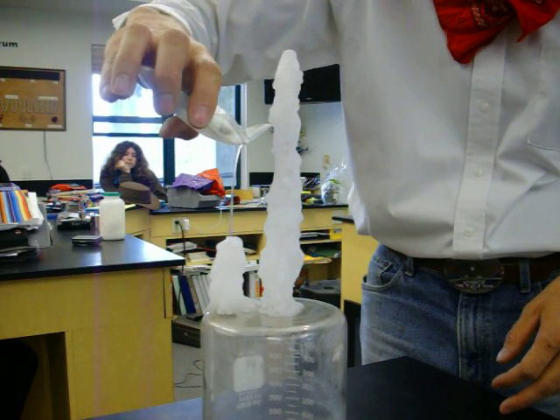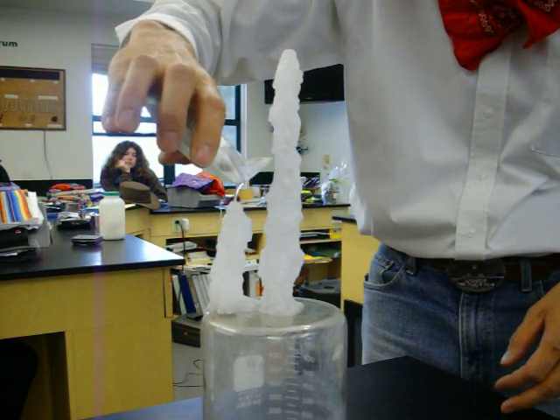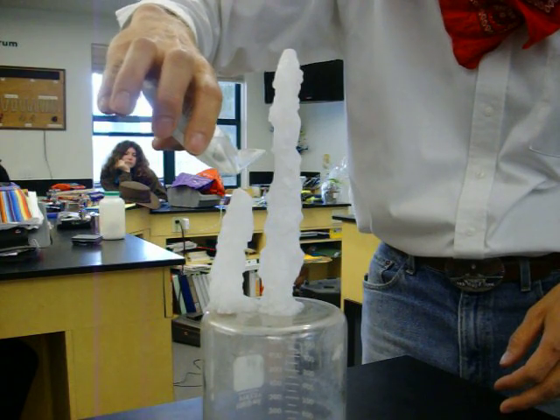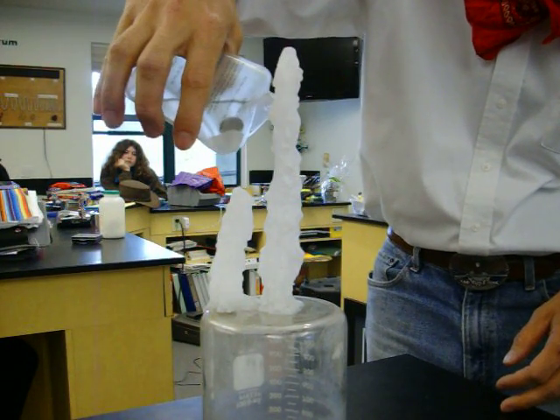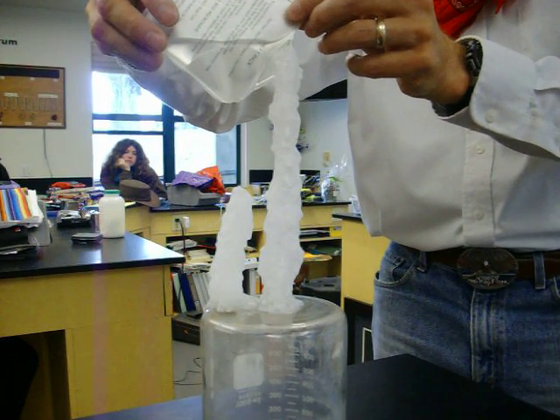If we get too close, it'll actually go up the stream and go into the container. Let's see if we can do that — there it goes. Oh yeah, see now it's into the container, it's spreading inside, coming out of solution.